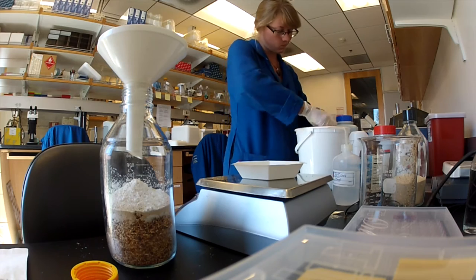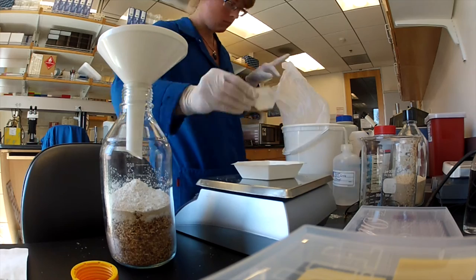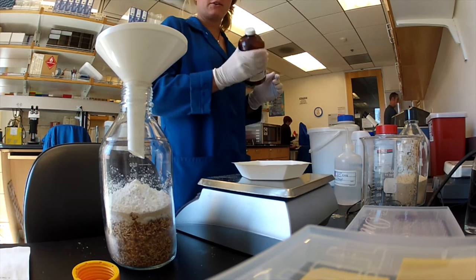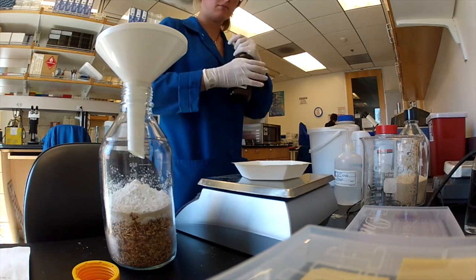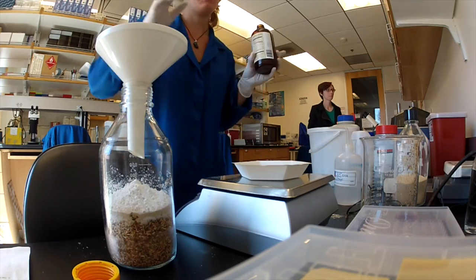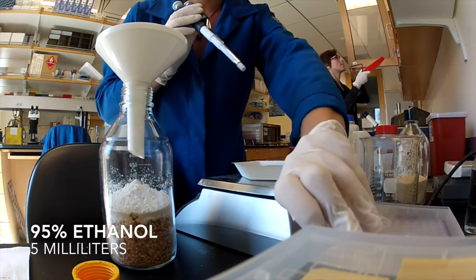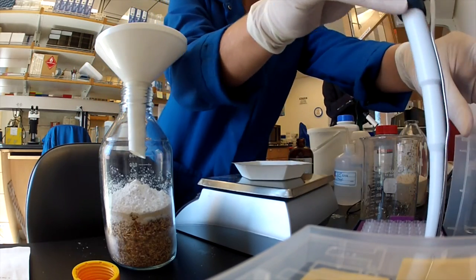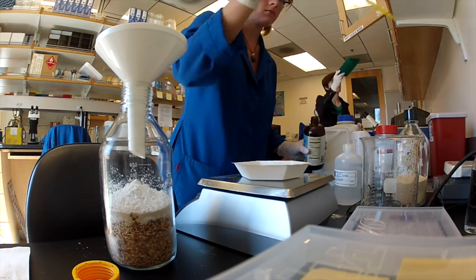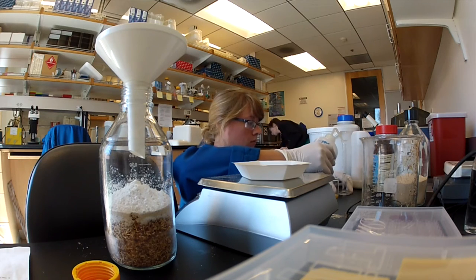The final dry ingredient is 1 gram of Wesson salt mixture. After all the dry ingredients are combined, we're going to add 2.5 mL of wheat germ oil — make sure you shake the bottle first — combined with 5 mL of 95% ethanol. Wheat germ oil is very viscous, which is why it's combined with the 95% ethanol; the ethanol loosens it and makes it easier to pour.